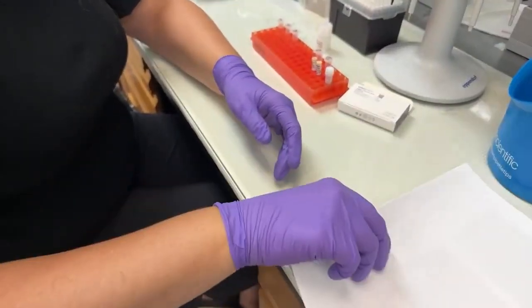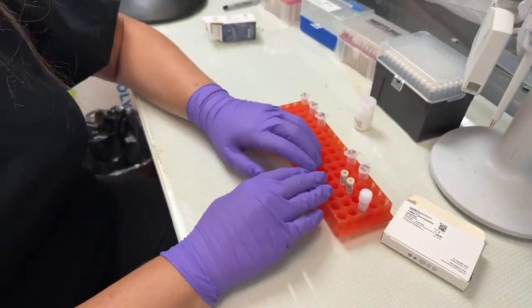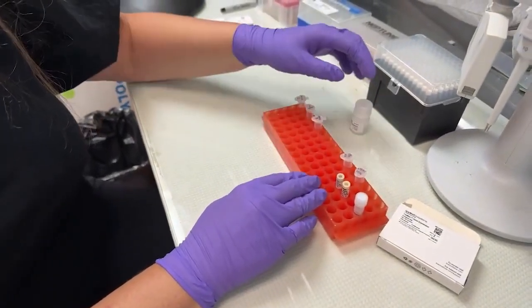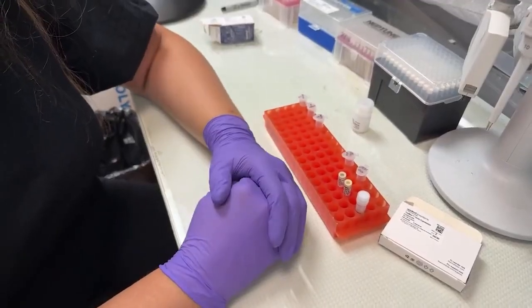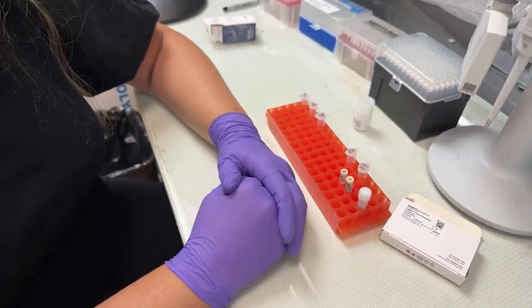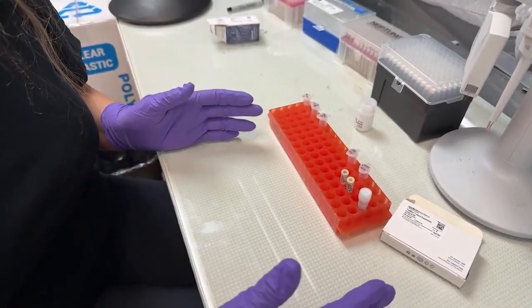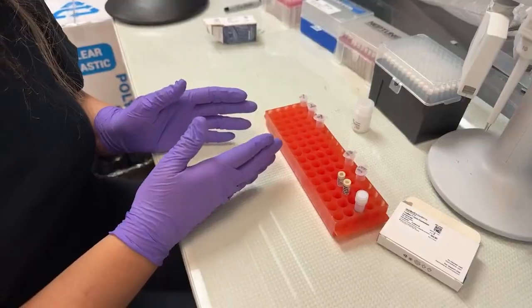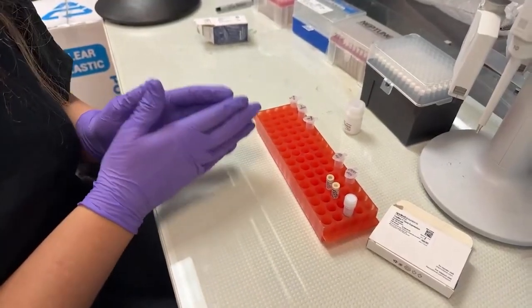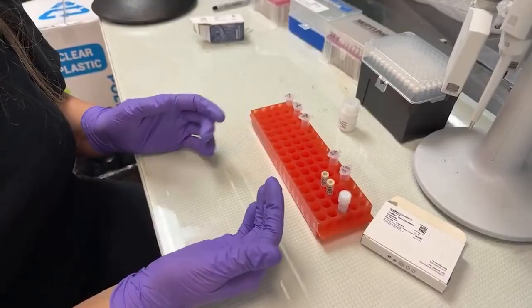The process today is going to be preparing the individual reactions. To do that, we're going to make what I like to call a sub-master mix. That sub-master mix is going to be everything except samples. I'll then aliquot that onto a plate and add the individual samples to individual wells. That reduces the number of pipetting steps, increasing our reliability.